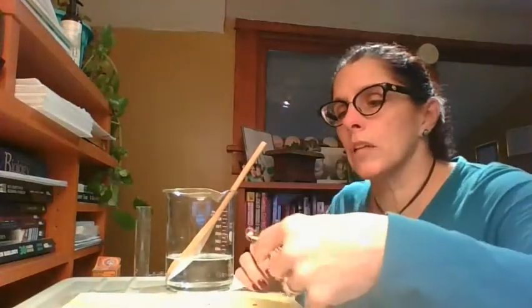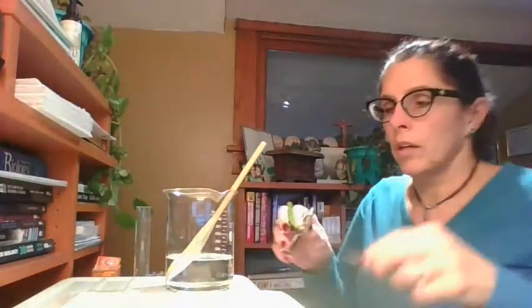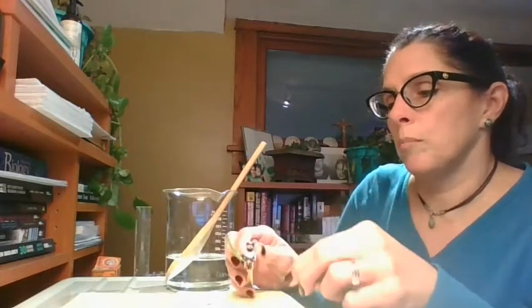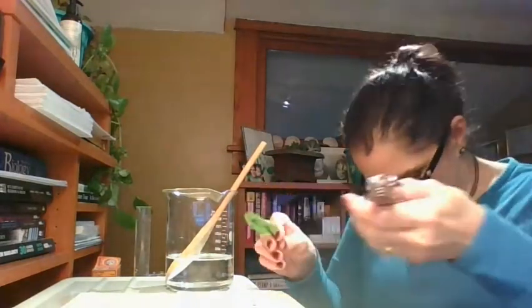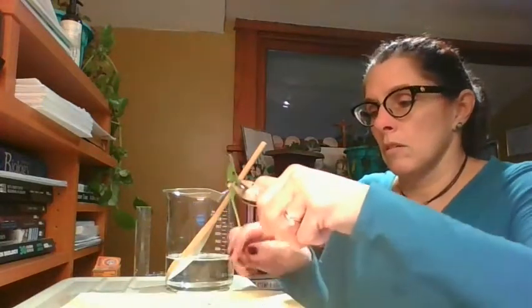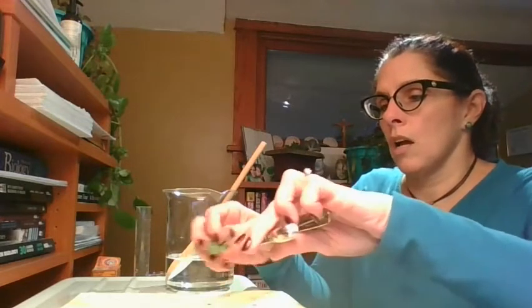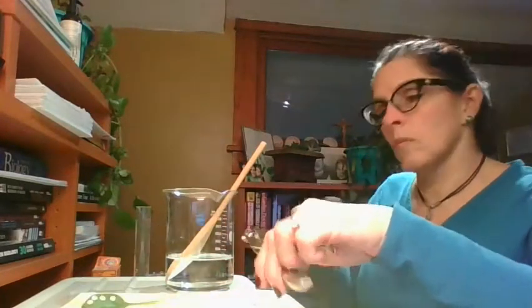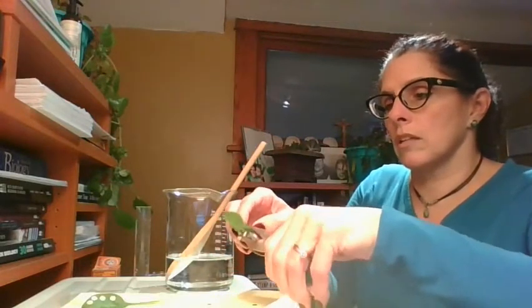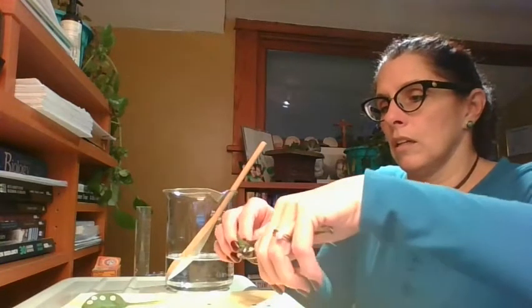I should have 6, but I think I only have 5. My leaf discs don't have to be whole pieces of the leaf, but they need to be big enough that you can at least see them. I have 4 decent ones here. I think I lost one. Okay, 5, 6, 7, 8, 9, 10.